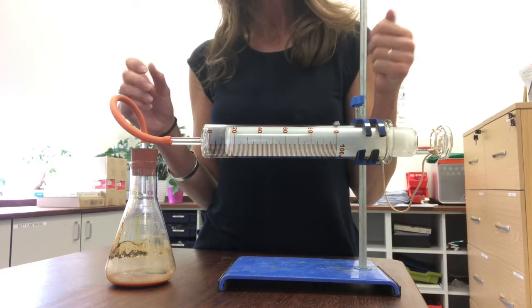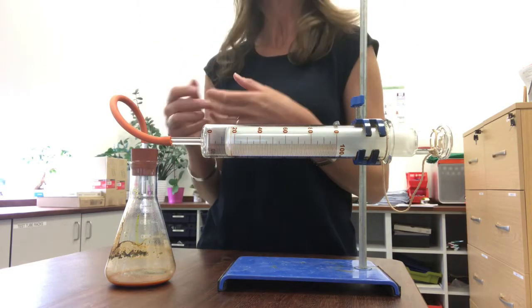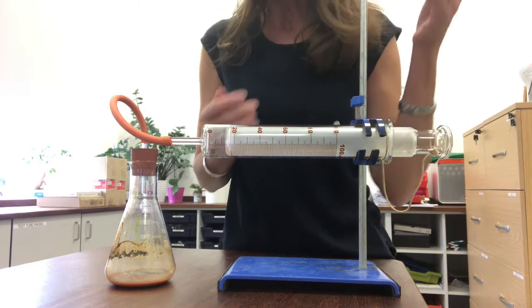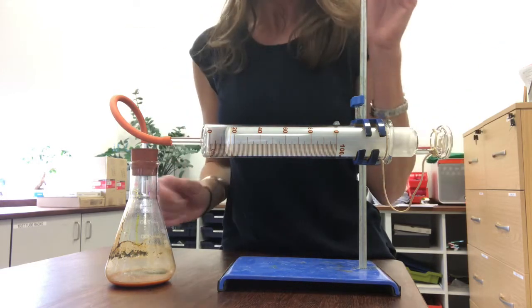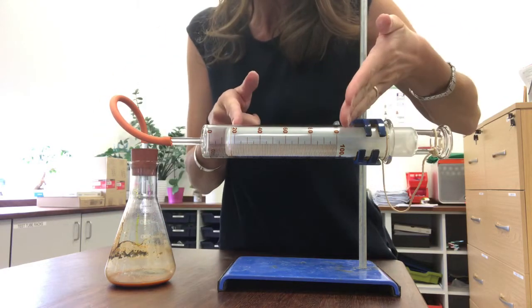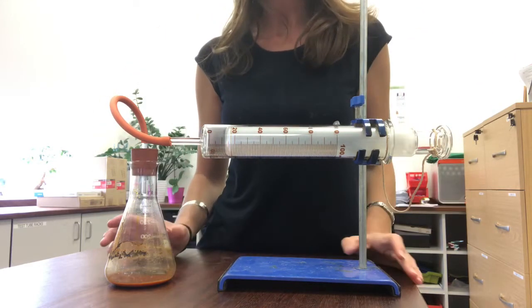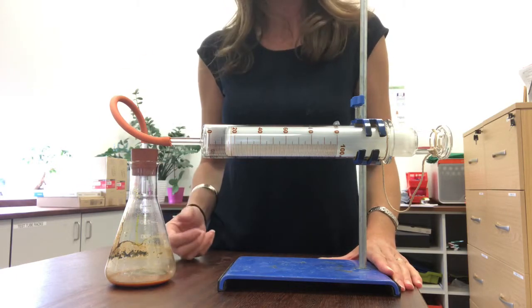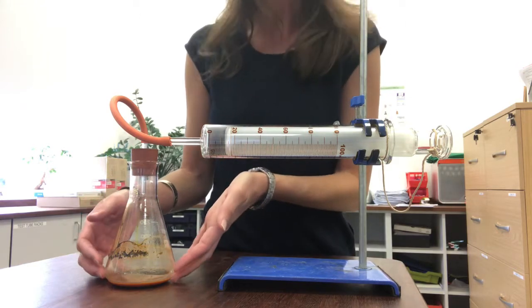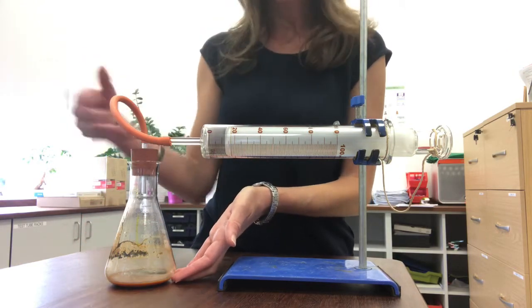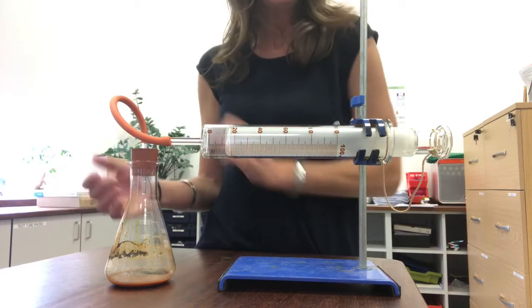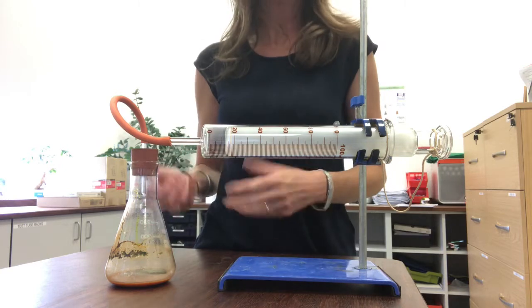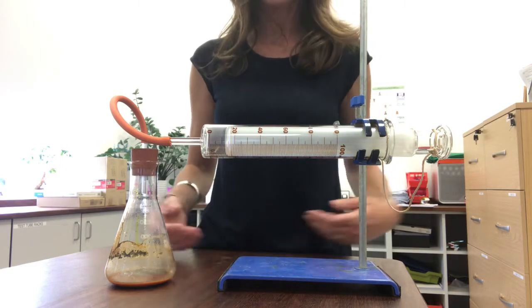Now what I need to do is to use that total volume of gas that was in the system, 415 millilitres, and compare that with the amount of gas that there is now in the system or the changing volume of gas that there has been in order to calculate the percentage of oxygen that was in that gas in the air. Remember the iron rusted and reacted with the oxygen that was in that gas. And so any change in volume is due to oxygen that has been removed, has been reacted with the iron. So we can use that to make that deduction about the percentage of oxygen in air.